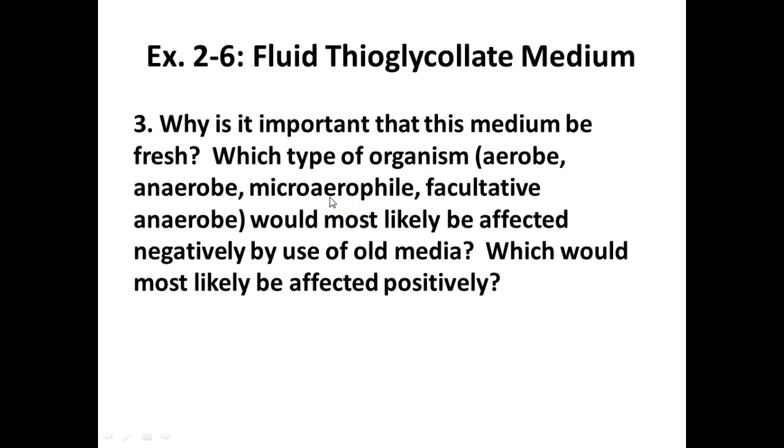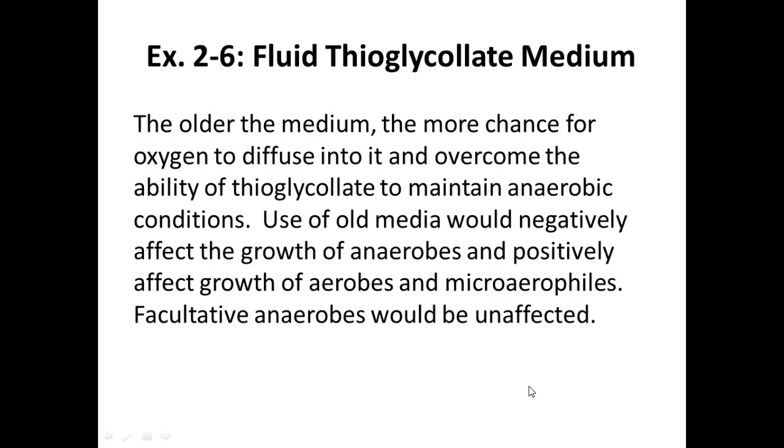Our microaerophiles, not so much, right? Because again, they do need a little bit of oxygen. There might be enough area. Our facultative anaerobes would be okay, but again, we wouldn't really be able to see that they're growing anaerobically if we don't have a lot. So who would be really happy about all this extra oxygen, right? Our aerobes, right? Our aerobes would be the most happy about that situation.